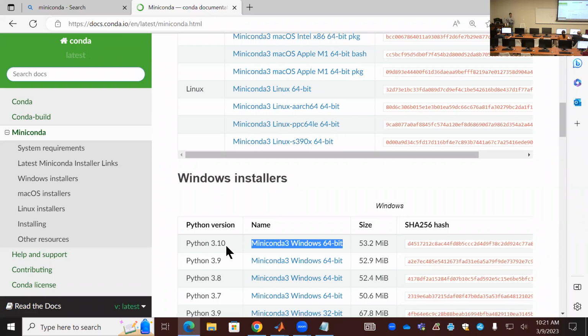We are going to install this locally to prepare your MATLAB and the Python environment side by side, so we can call the function. If you have a Mac, you should also be able to use this Python at the same time.